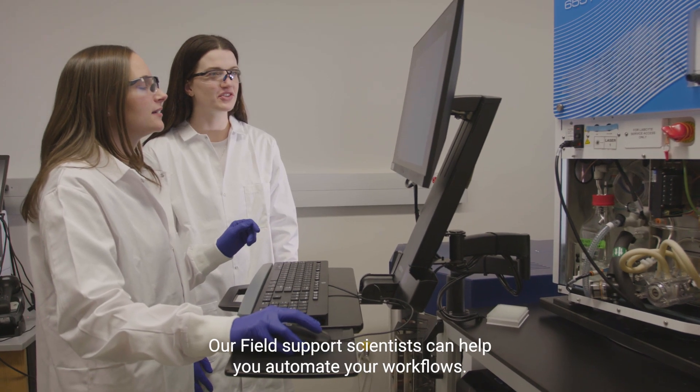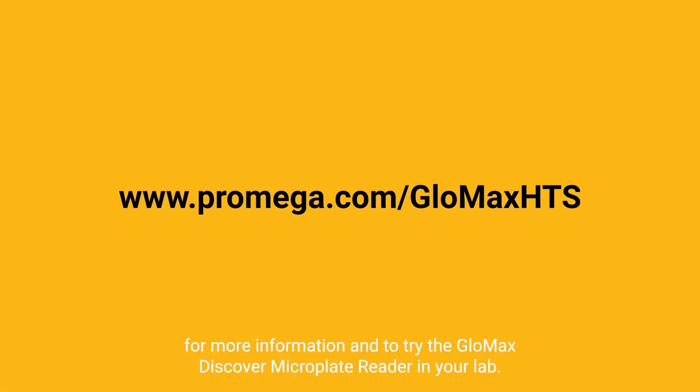Our field support scientists can help you automate your workflows. Visit promega.com today for more information and to try a GloMax Discover Microplate Reader in your lab.